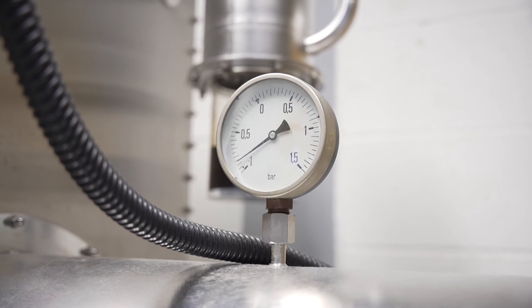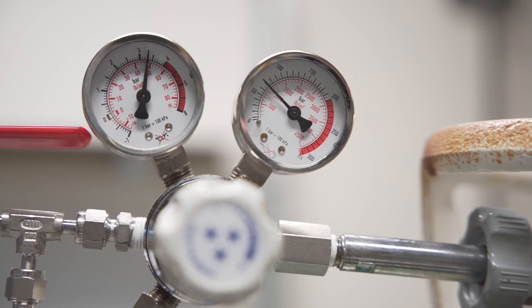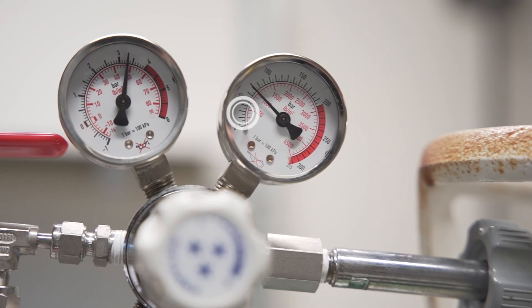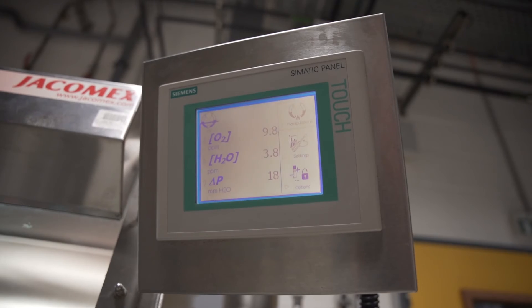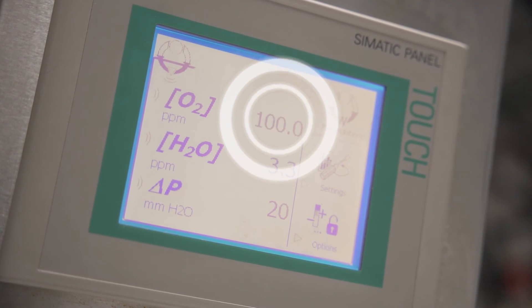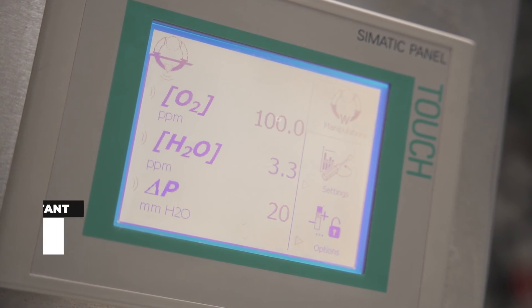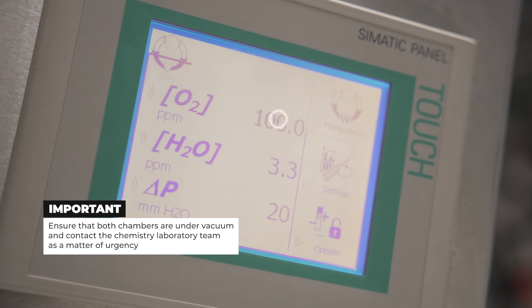Check that both chambers are under vacuum — pressure gauge needle below zero. Check the levels of the argon gas bottles; they should be replaced when they are below 20 bar. Check the oxygen and water levels on the control screen. If the oxygen level reaches 100, ensure that both chambers are under vacuum and contact the chemistry laboratory team as a matter of urgency.